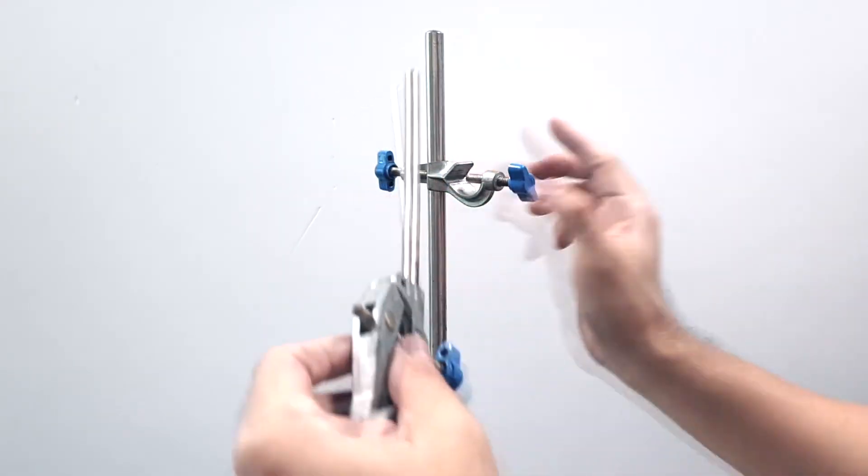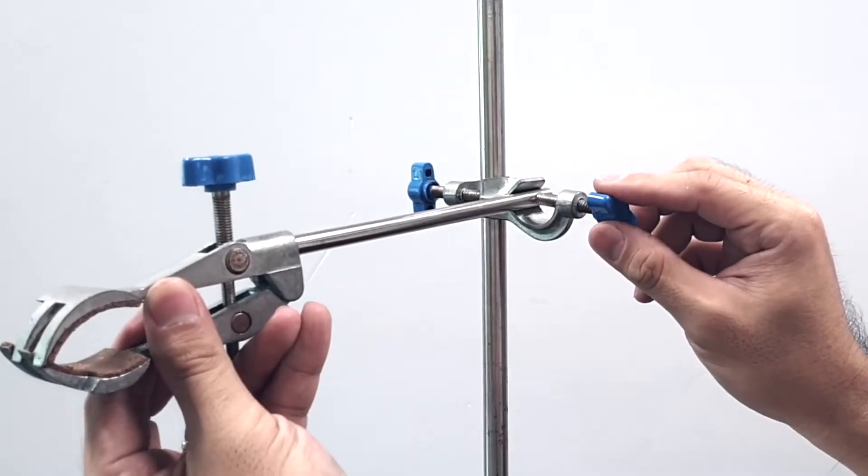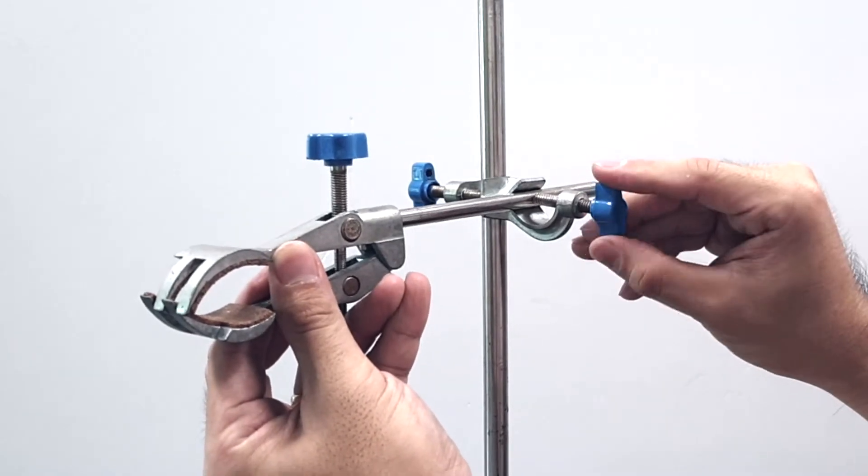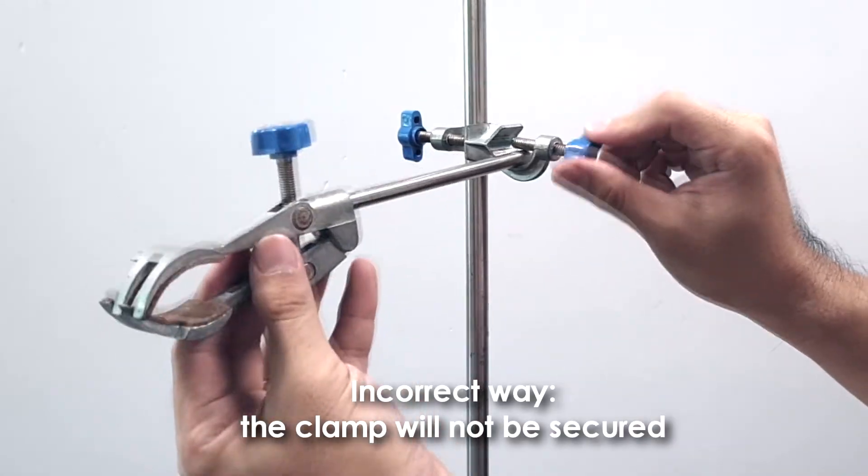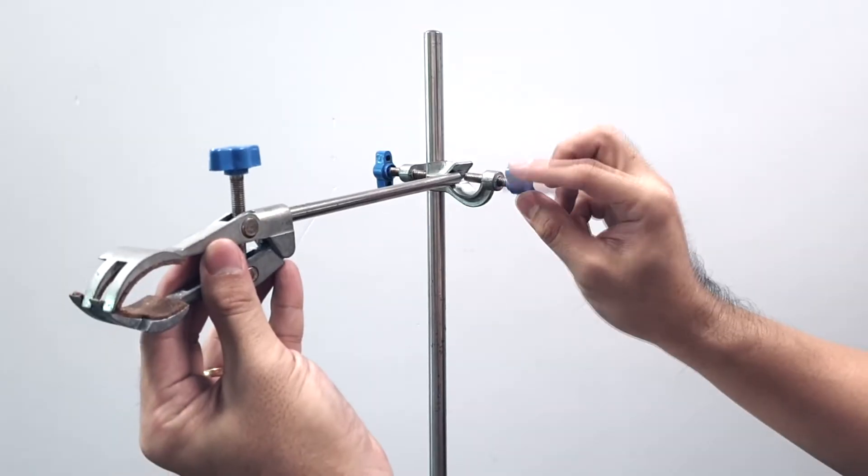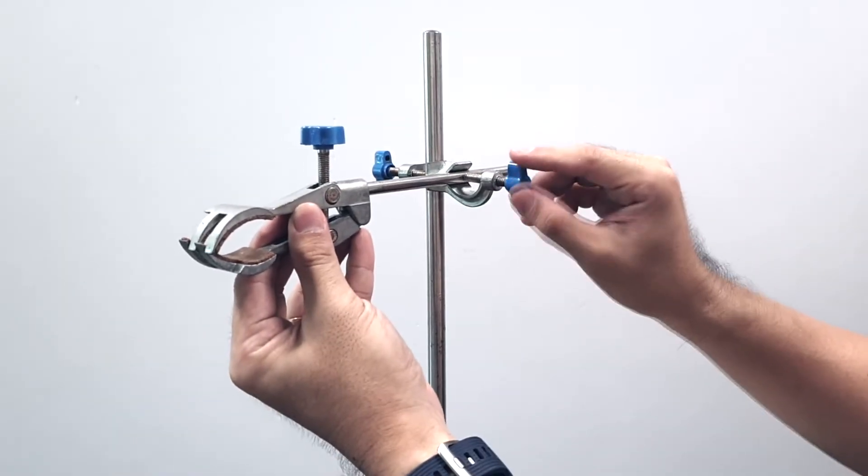Insert the shaft of the clamp into the boss as shown. Pay attention to the position. This is the correct way. Do not insert the shaft into this position here because there's no way you can tighten it. So do this properly.